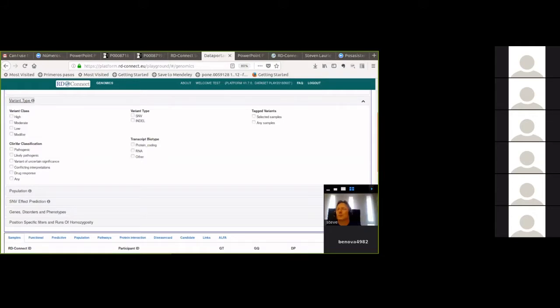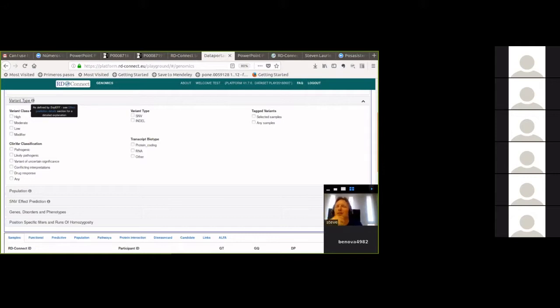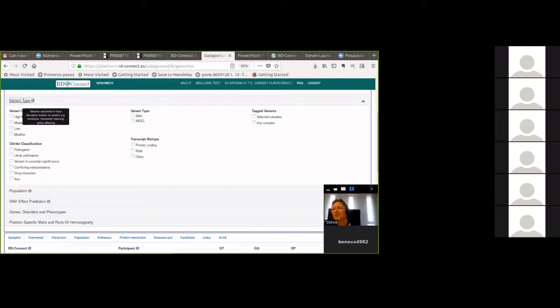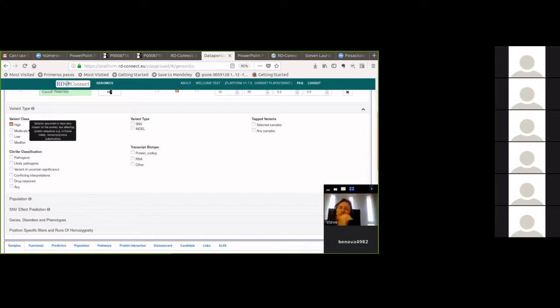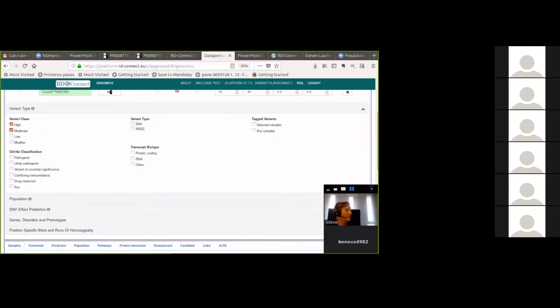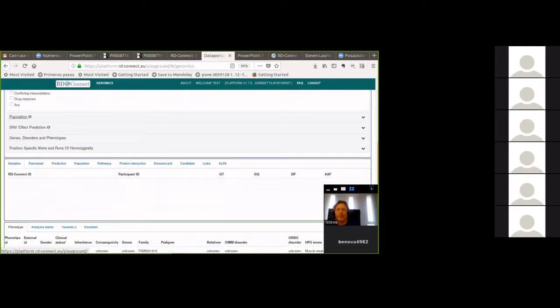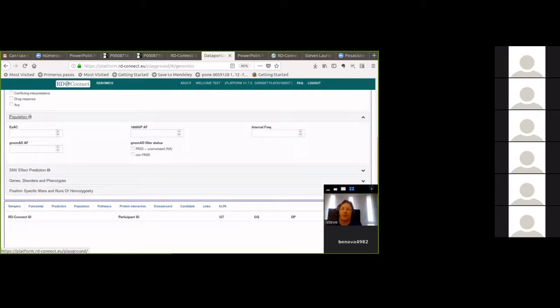Many fields have tooltips explaining what they mean, since many are not intuitive unless you're familiar with variant data. The variant class filter uses SnpEff — hovering over 'high' tells you the variant is assumed to have a damaging effect. 'Moderate' variants are generally non-synonymous or in-frame indels. When working with exomes, the first thing you want to do is look at high and moderate variants.